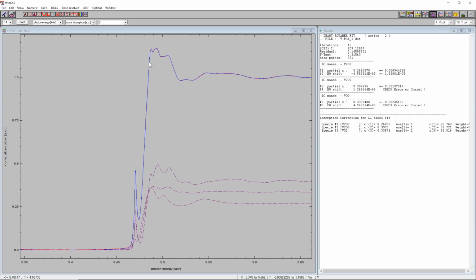However, as I pointed out in the first part of this tutorial, there is no way to be sure when just refining the sum of spectra to a single experimental spectrum. We do not know how many references we really need. We do not know how many phases are present in our mixture, and we cannot be certain that the references selected are indeed the chemical phases present in the sample spectrum. All looks very decent and all looks very probable, but there is no certainty here.